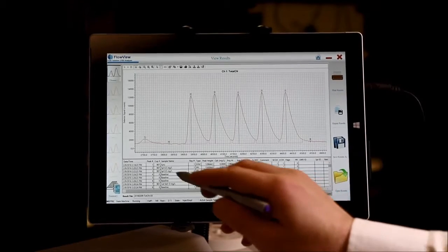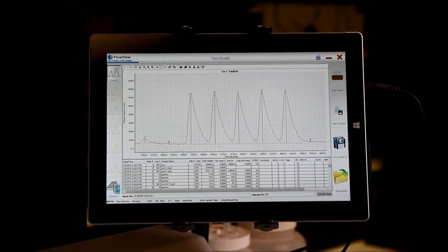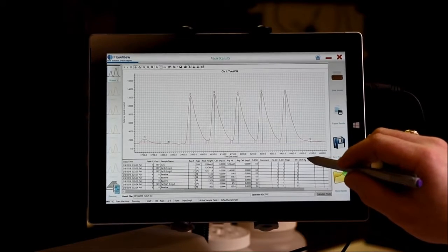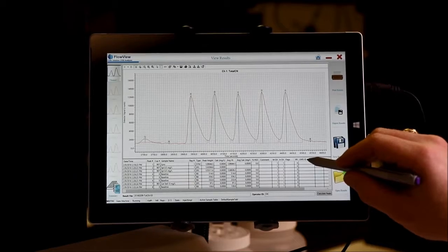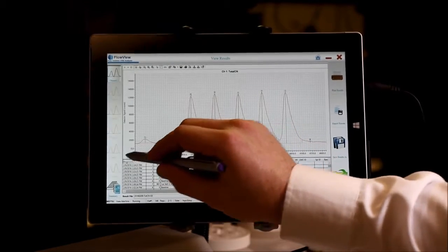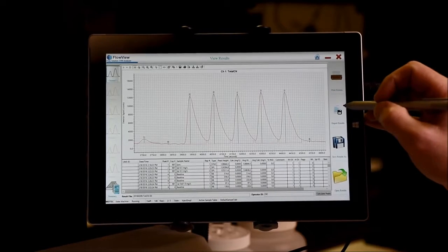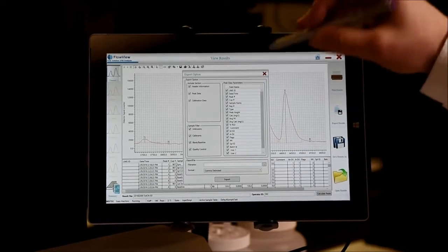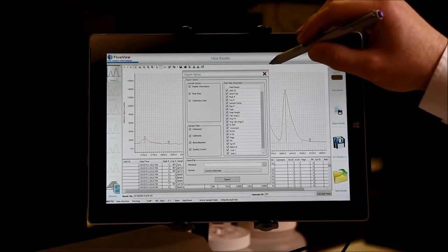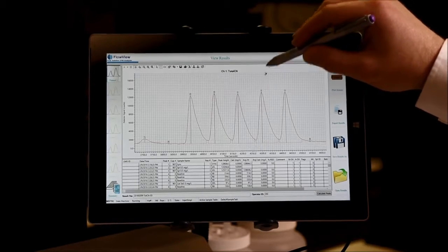In fact, if you have a problem configuring your LIMS or getting reporting the way that you want, perhaps you need the LIMS ID currently here on the screen to be the first field. Simply click and drag it to the first field, then click on Export Results, and you'll notice that LIMS ID is now the first field that will export.